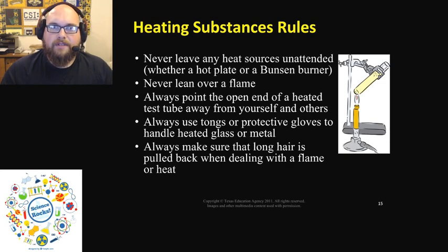Okay, heating substances. We're not going to be using flames, but if you do, make sure that that flame is a safe distance from you, and never lean over an open flame. Use tongs and protective gloves to heat glass and metal so that you do not burn yourself.